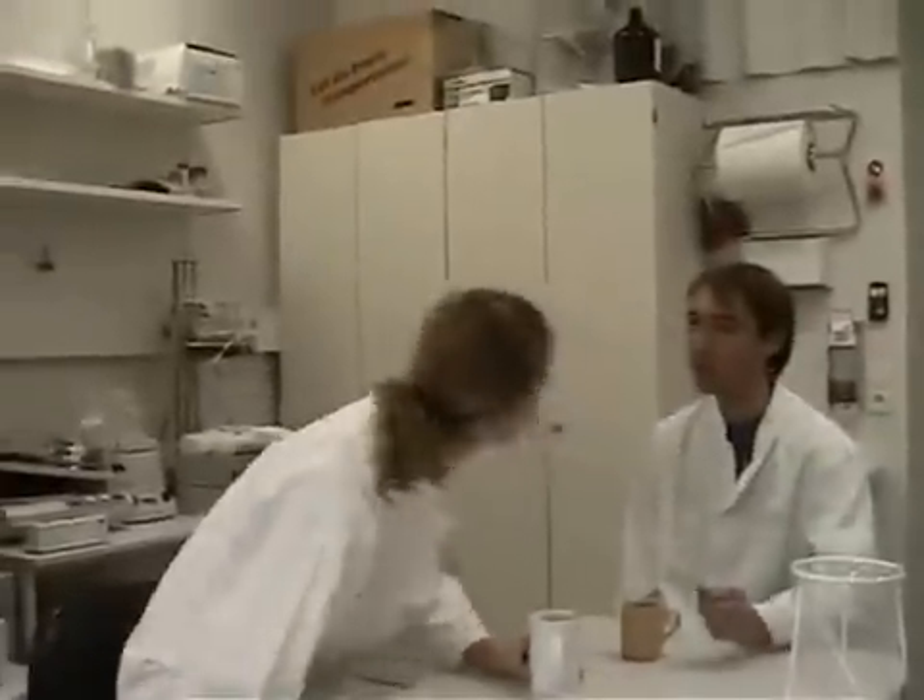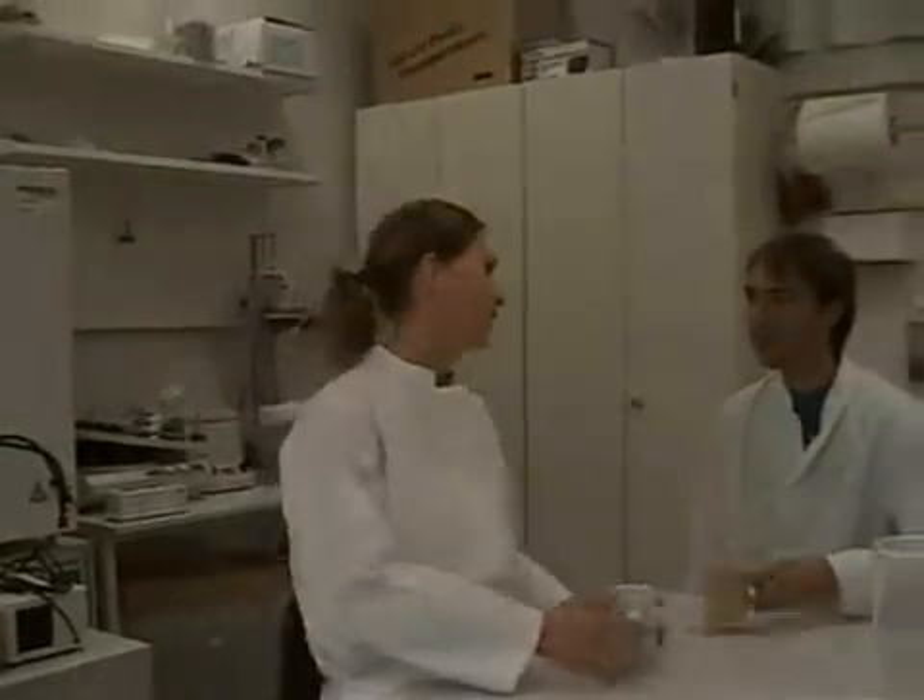Instead of sitting in front of the machine, your staff can focus on the data analysis, or have a break.